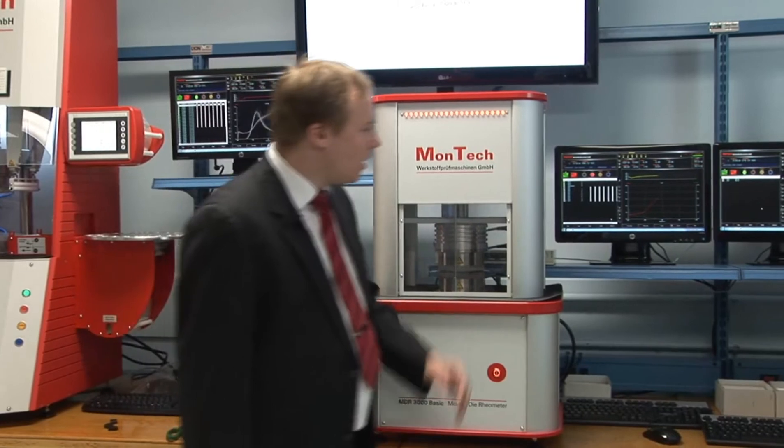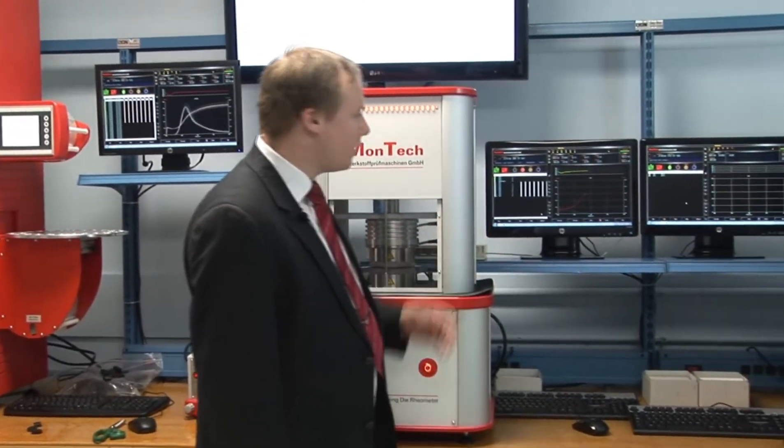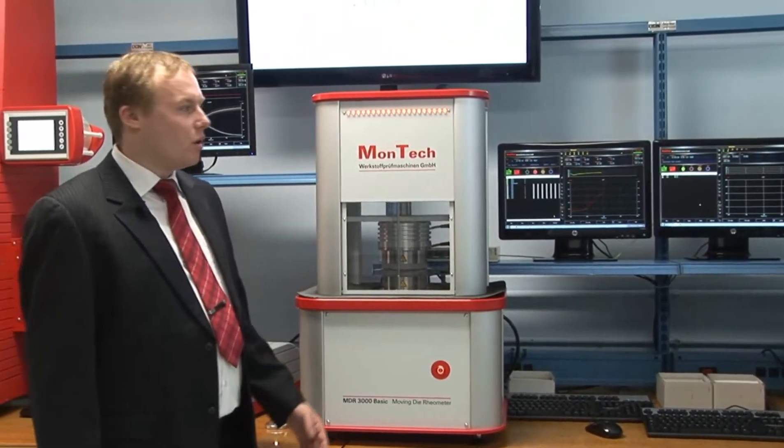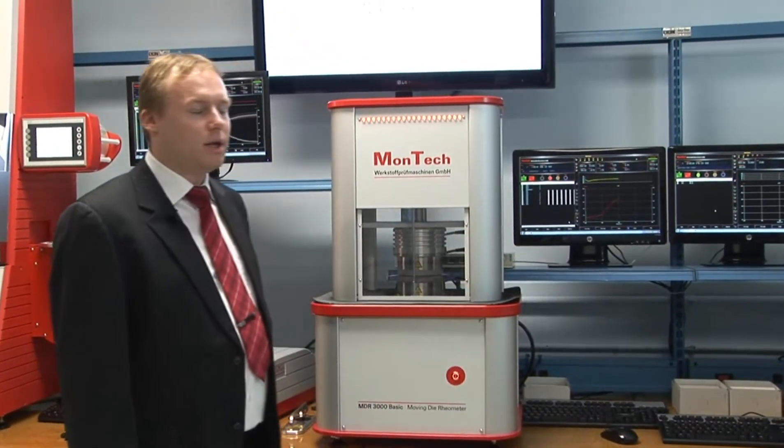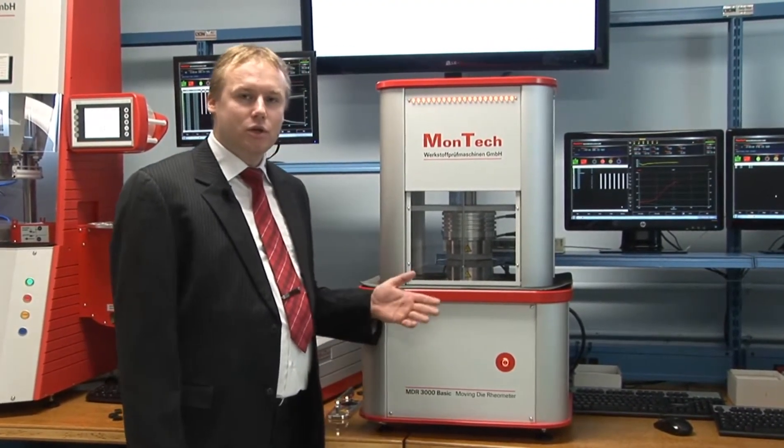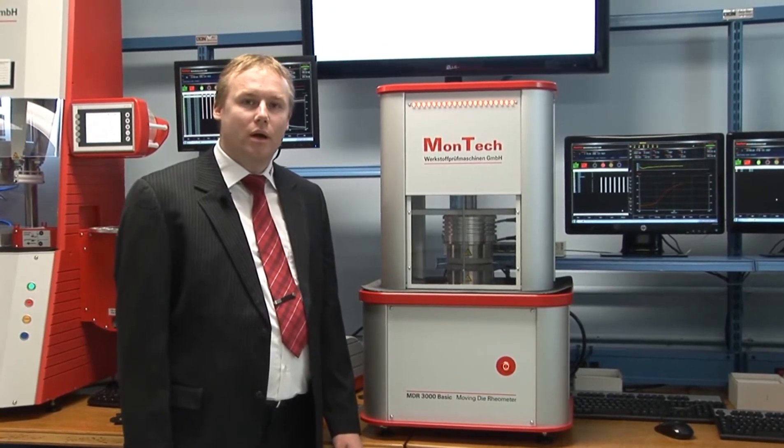Now you can see the data is recorded in the software. The cure graph is shown on the screen of the MONTECH control software, as well as all settings and readings displayed on the main screen. After the test is finished, the safety shield and platens automatically open, data is calculated, and if you like, a batch report or sample test report can be automatically printed.